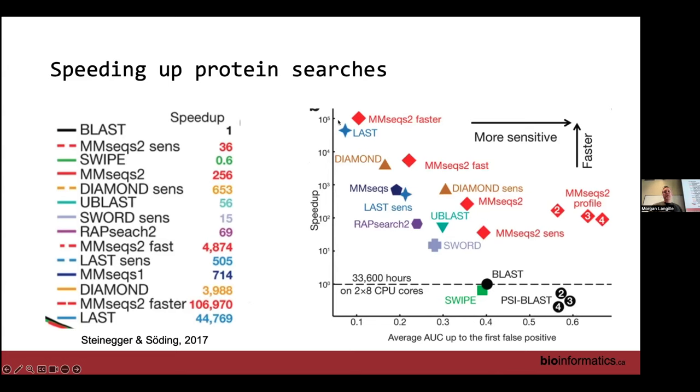If you think back now to their algorithm, like I just told you, this mapping is based on those reads that map to strains from MetaPhlAn. And then this unclassified is basically anything left over that was done at the translated search that hit this gene, sorry, but didn't come from the MetaPhlAn hit. And this is just showing that these values then obviously sum up to the value for just the unstratified.